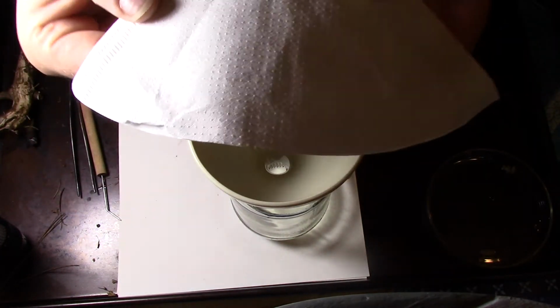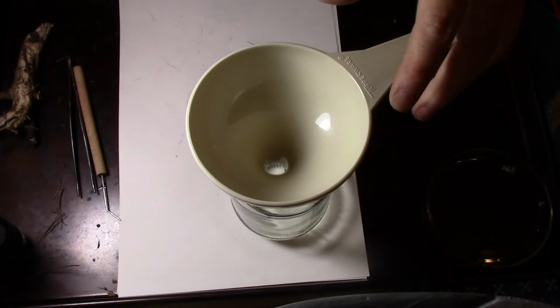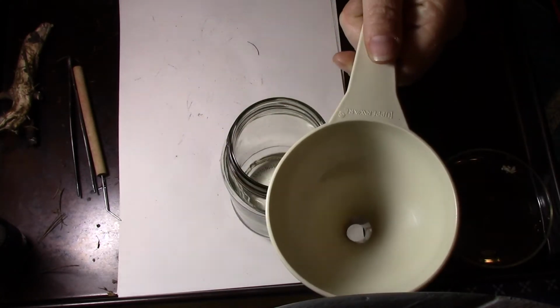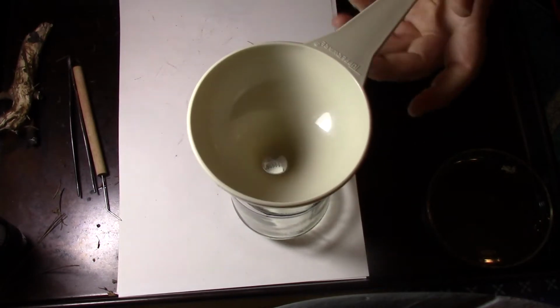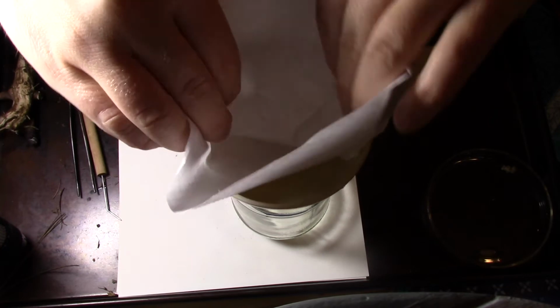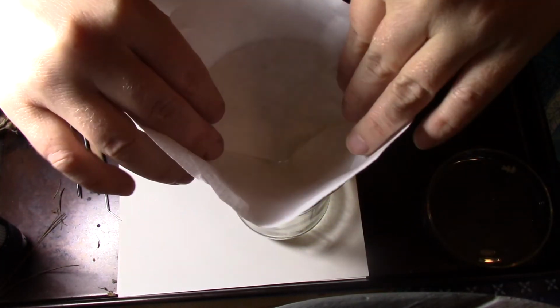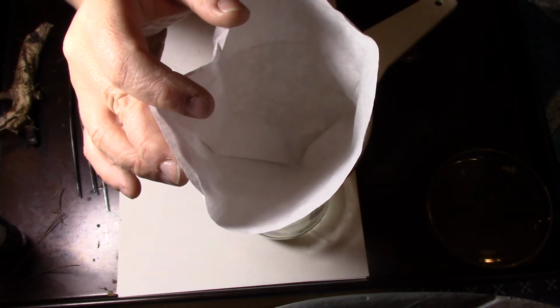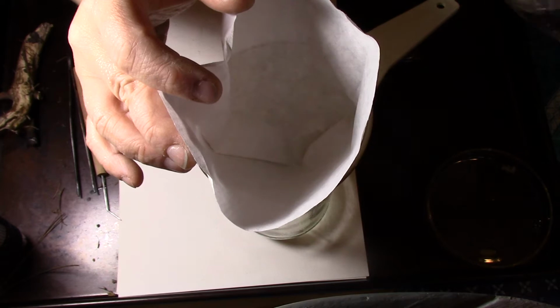left. So this is just a coffee filter, and this is an old Tupperware funnel because my mother was a Tupperware lady, so I have a lot of old Tupperware. But I'm sure you can find something that is of similar use. I'm hoping this works. I'm doing this live because I don't want to do it twice. I'm swirling my sample because I don't want to have any little bits left over.